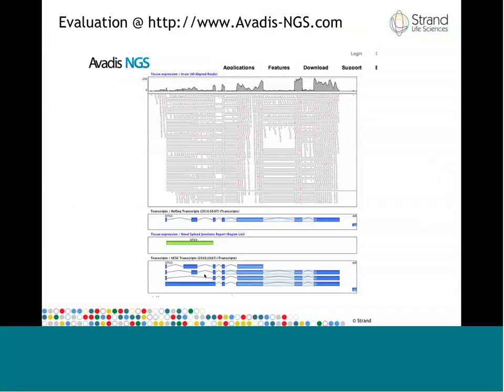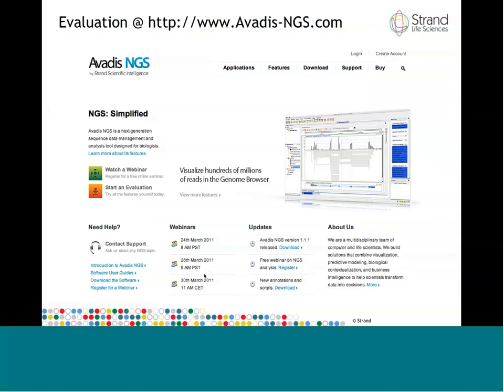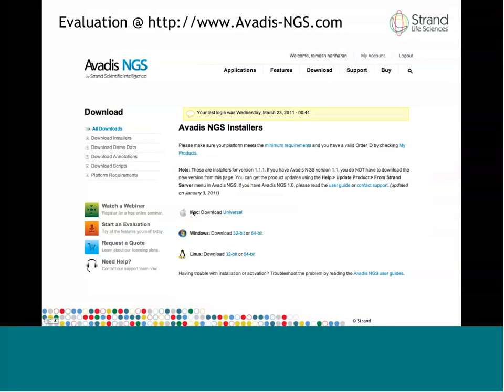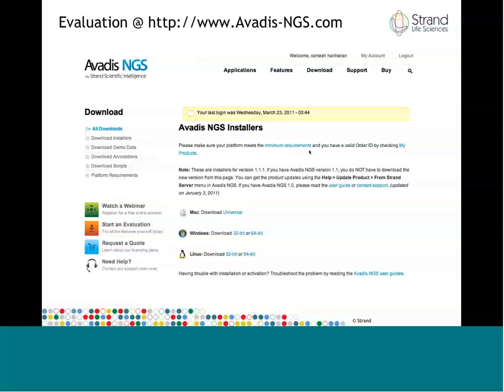So that brings me to the end of the presentation. I'd want to leave you with a couple of pieces of information. One, you can go to www.avadisngs.com and download an evaluation version. When you try to download an evaluation version, the system will offer you a Mac, a Windows, or a Linux version, whichever you please to use. Minimum requirements for these versions are present here so that you can check those. All of these versions are intended to run on standard laptops as well. For instance, the machine I'm demonstrating from is a standard Mac laptop.